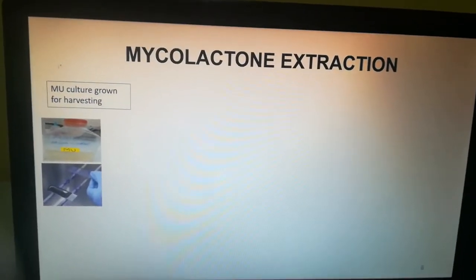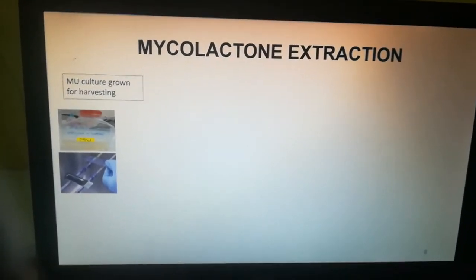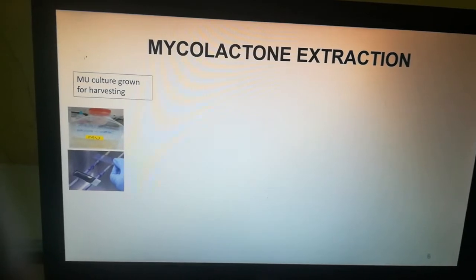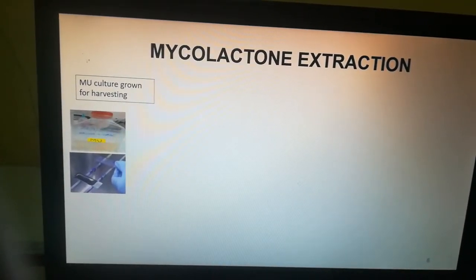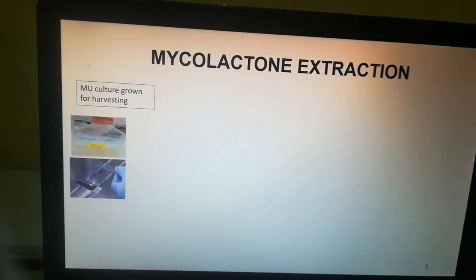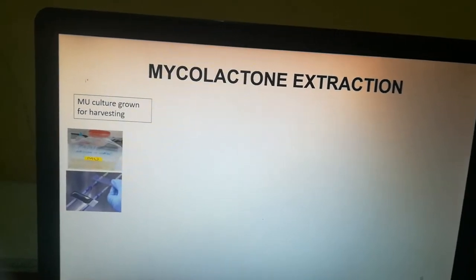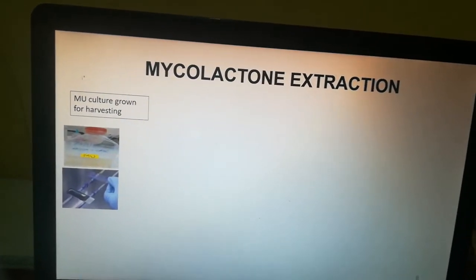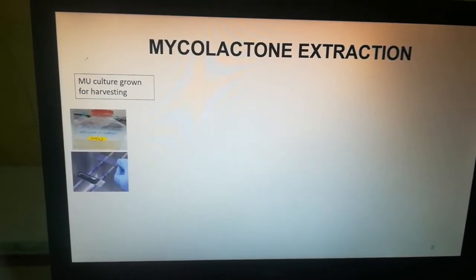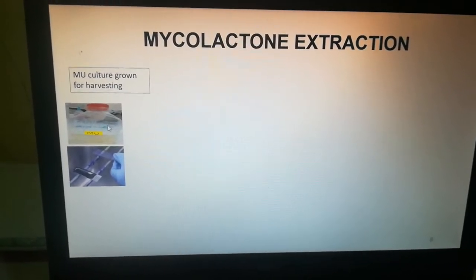Hi everyone. Today we are going to learn about mycolactone extraction. Mycolactone is a lipid toxin which is produced by a bacteria, and that bacteria is a Mycobacterium called Mycobacterium ulcerans. In this presentation, Mycobacterium ulcerans is going to be abbreviated as MU.